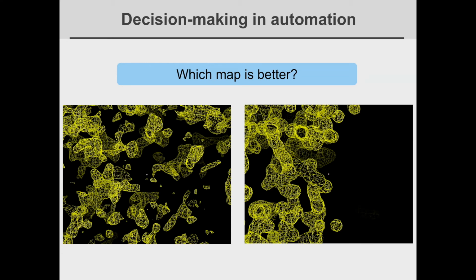Continuity, continuous chains and side chains visible on the right. Clear separation, continuous density, solvent region obvious. The density. Perfect. Okay. Yeah. Perfect. These are great points and exactly right.